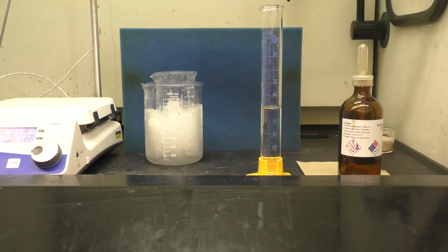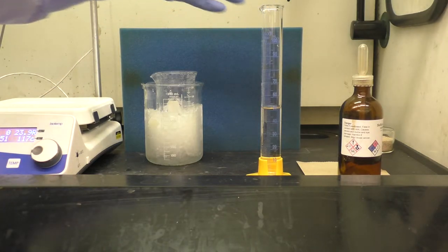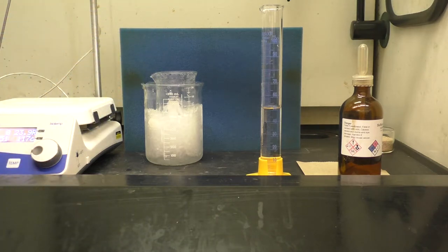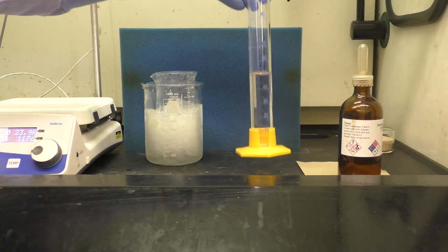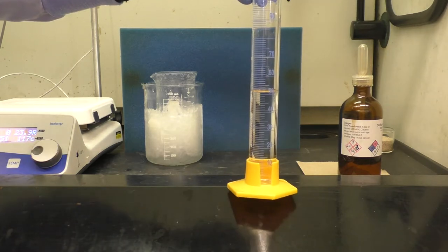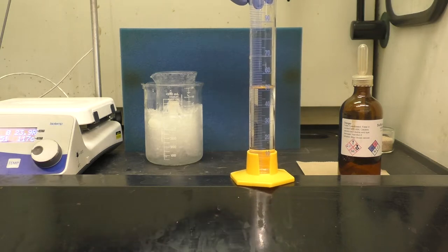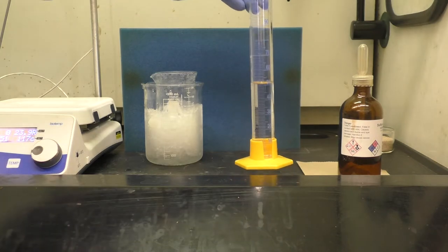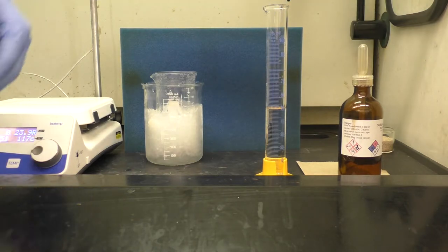It's not critical in this case, since I'm simply using the sulfuric acid to neutralize the solution and protonate the carboxylate that results from the base hydrolysis. It's not crucial to use exactly 50 milliliters. Here I have slightly more than 50 milliliters, just about 52, but this is now sufficient. I'll now very carefully add this into the reaction mixture.